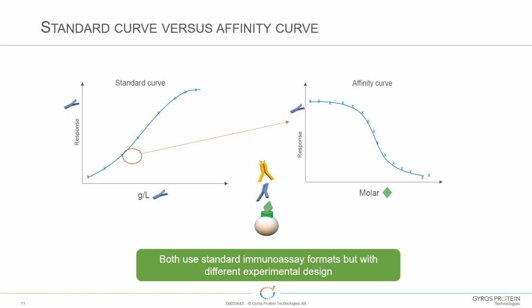Yeah, I mean, you have to start by obviously pre-incubating your drug and target in solution, and then what hasn't reacted will then bind within the assay. So when you actually design the experiments, you start off by doing a concentration curve as on the left, and then based, as Rob said, on the signal to noise, you select a single concentration of your drug, and then you vary the concentration of the target, and that causes inhibition of signal. And actually the selection of concentrations is quite an interesting thing, and is where a lot of the complexity in setting the experiments up lies.